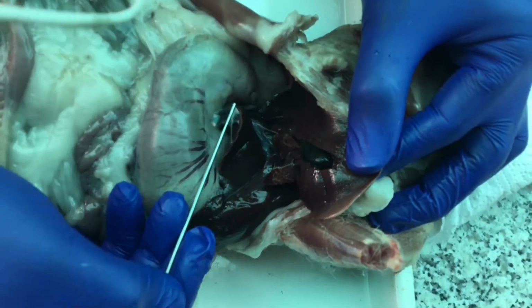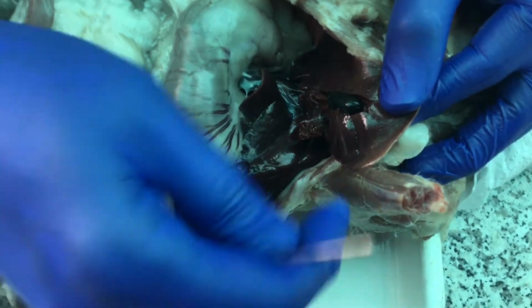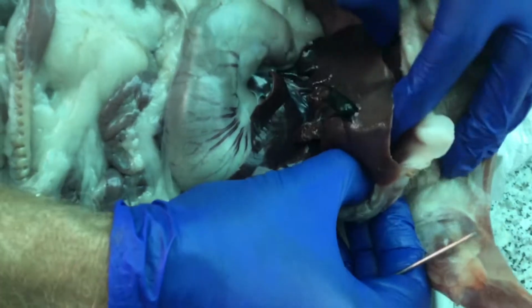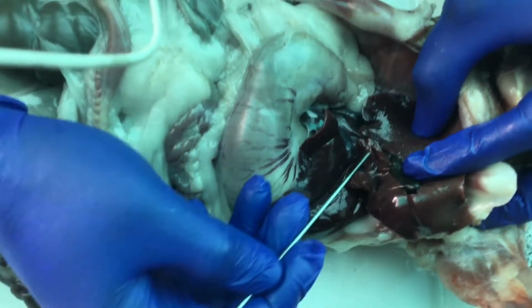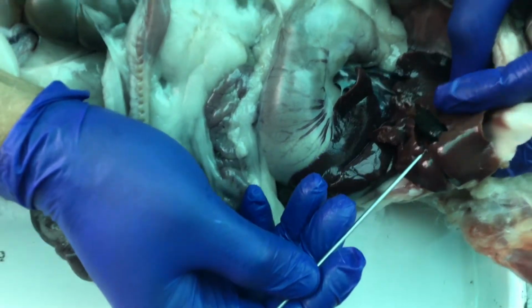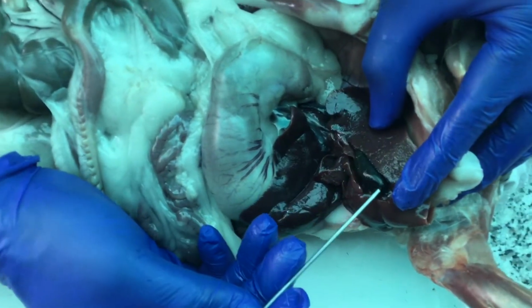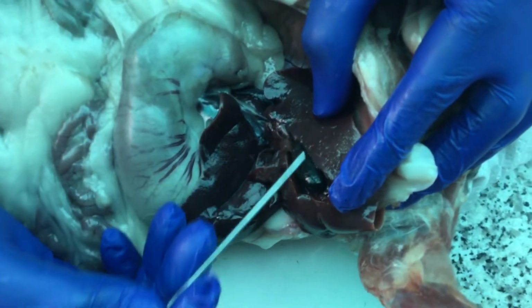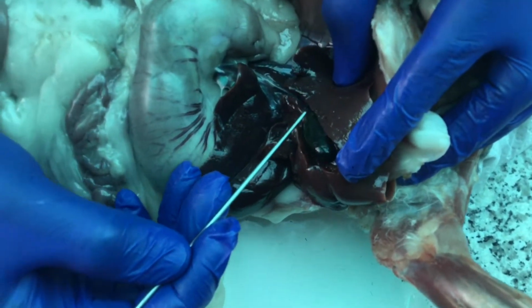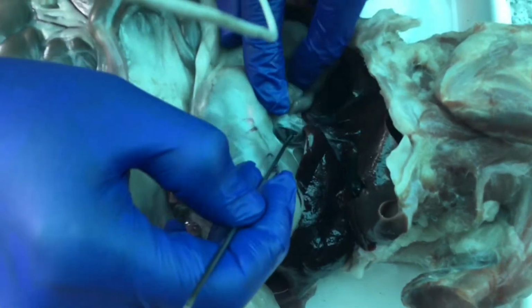You can see there's some of those mesenteries again, or saran wrap linings, that even cover the liver and everything in the abdominal cavity. That would be part of what we call the lesser omentum. There's that flappy sac there, a very dark looking flap on the underside of the liver, which is the gallbladder full of bile. The bile that the liver produces collects there, and then it goes through this little duct here right into the start of the intestines, right here.